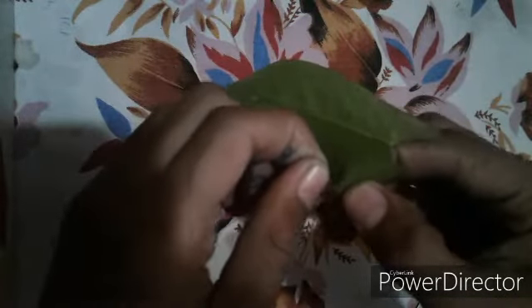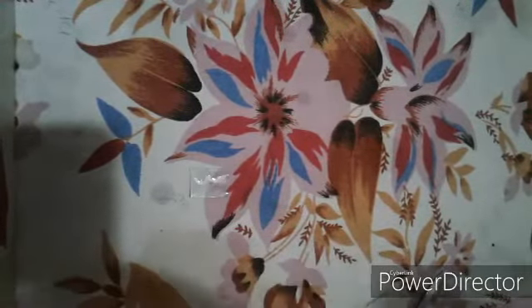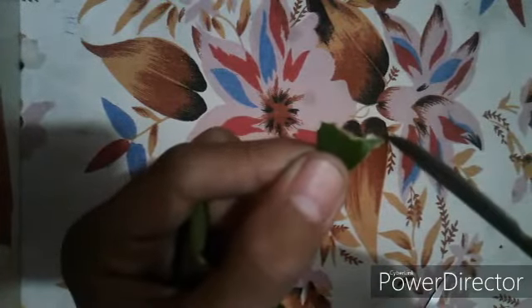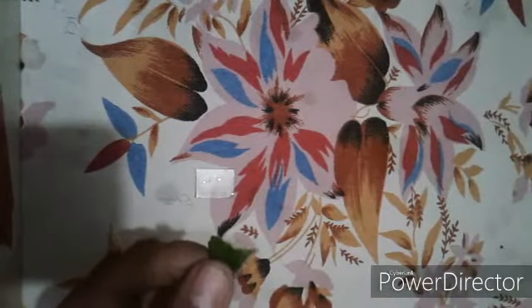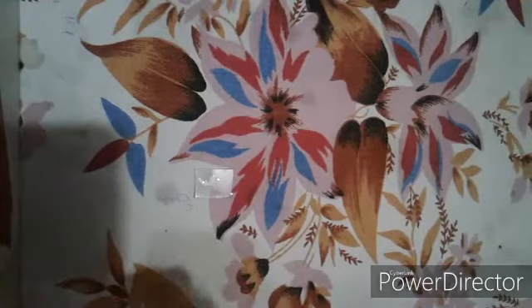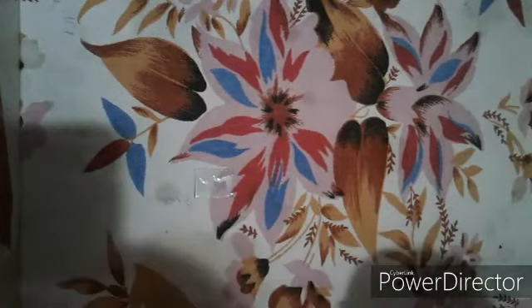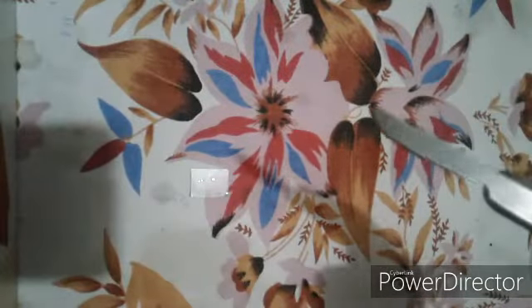You are going to peel it like this, and there are some tiny particles of it. You can see that this is our slide and this is our peel of stomata. Now I am going to stain it.